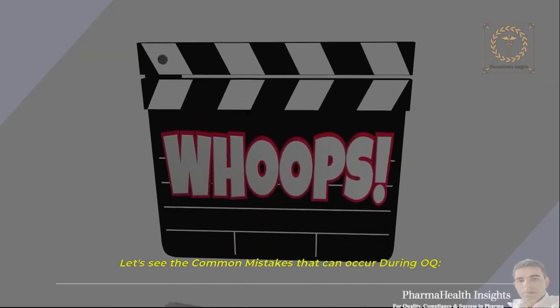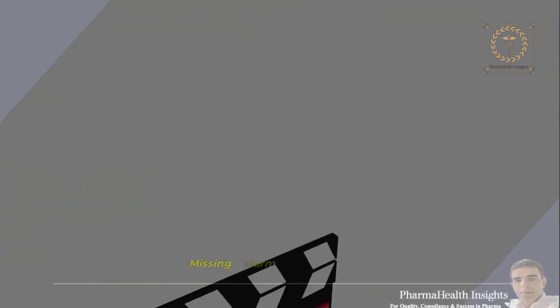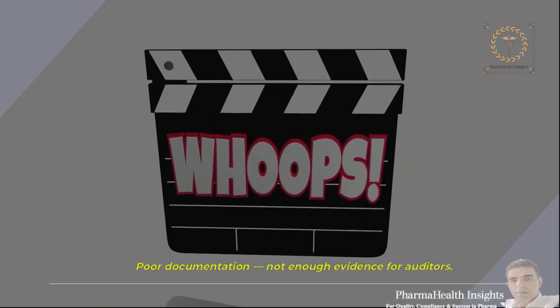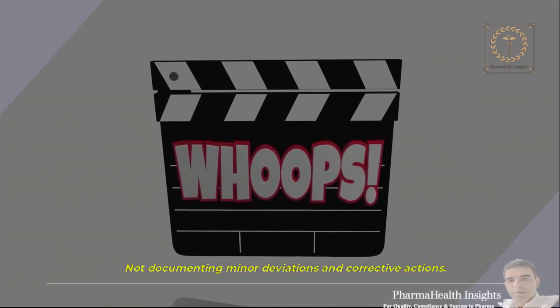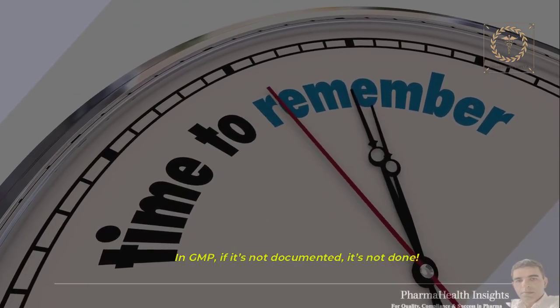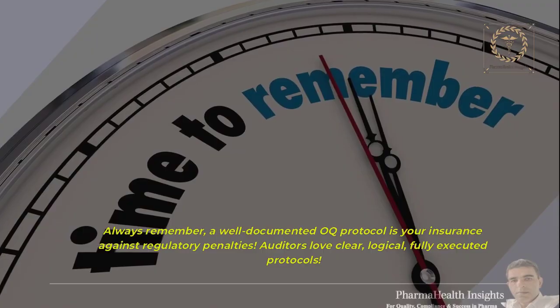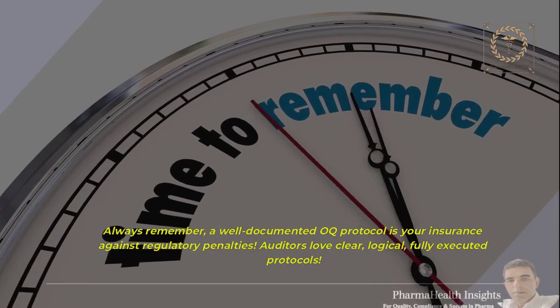Let's see the common mistakes that can occur during OQ. Starting OQ before completing IQ, missing alarm and interlock testing, using vendor default settings without verifying ranges, poor documentation, not enough evidence for auditors, not documenting minor deviations and corrective actions. Remember, in GMP, if it's not documented, it's not done. Always remember, a well-documented OQ protocol is your insurance against regulatory penalties. Auditors love clear, logical, fully executed protocols.